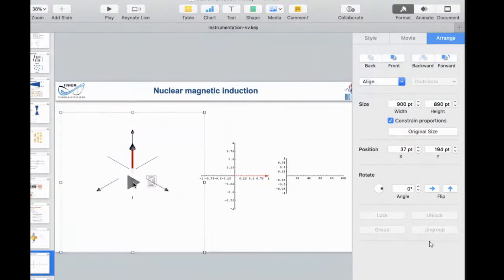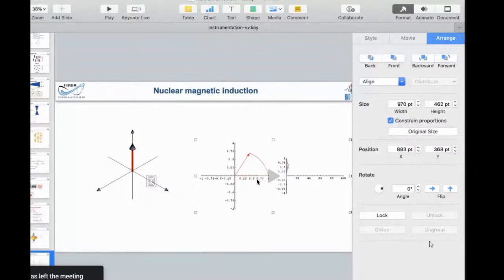When you apply the radio frequency, the magnetic moment is going to come down here and then start going around. And you will see that it is going up also slightly. It's 3D. Now, if there is a coil, because you apply a pulse, you basically stop the pulse. And what happens? This coil is there, and the magnetic moment is going around. It is cutting this coil, creating a current, which is what we are going to observe. Since it is going up, the current is reducing. So at first it is a high current, and then it starts reducing.